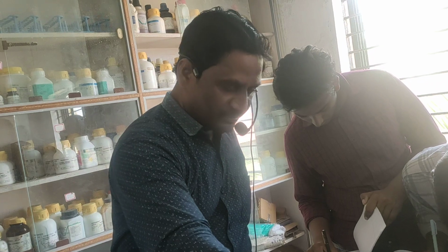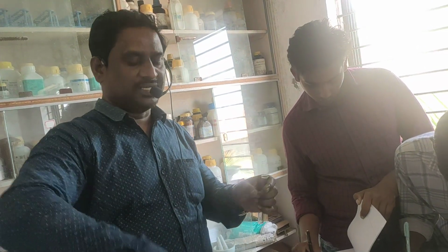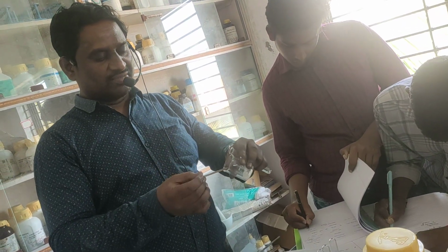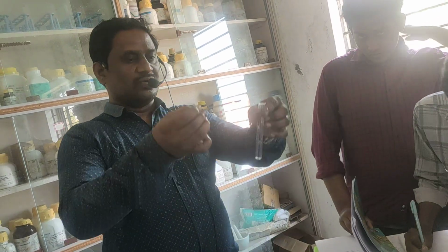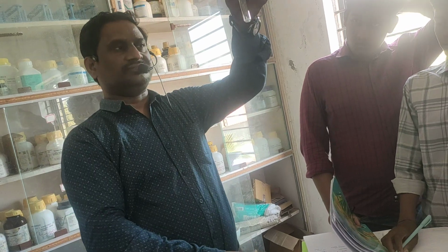Look at all of you here. So, detection of the first group. What should we do? Again the same test. We should take the given salt. Now we are detecting for this one.